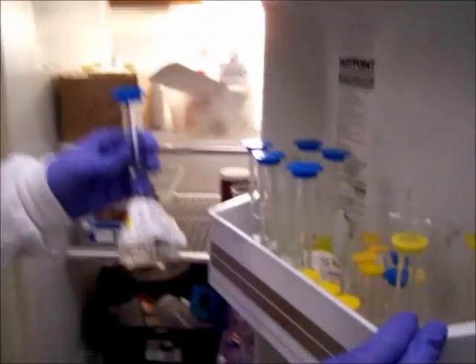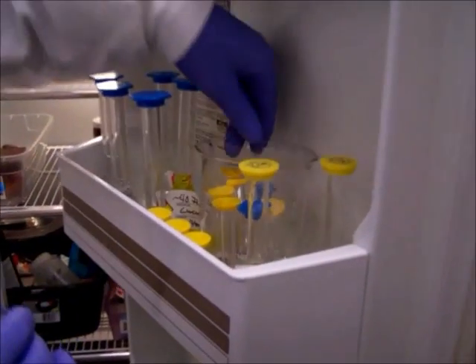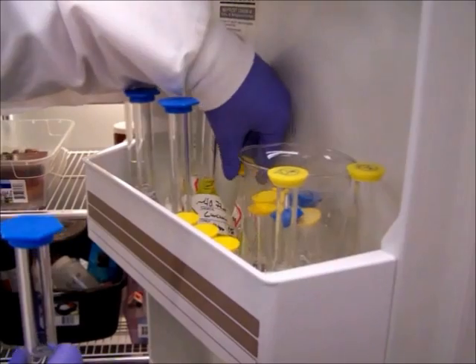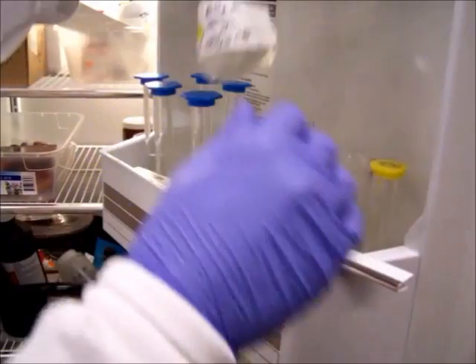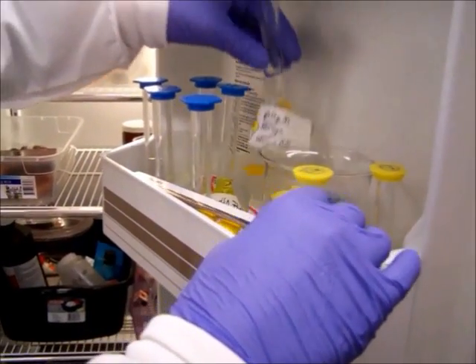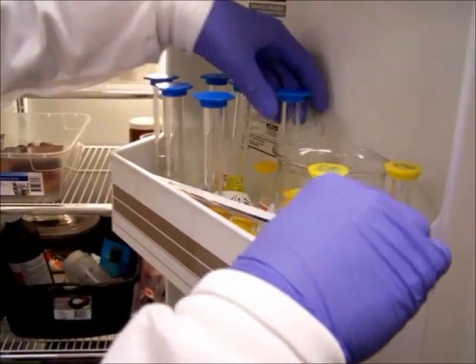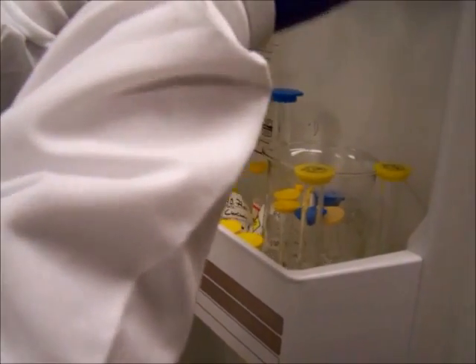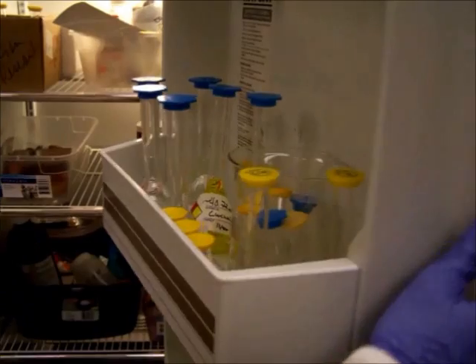So for now, we're storing our various polyphenols in this fridge that's falling apart. Something smells like poison. It probably is. OK. Let me store it there.